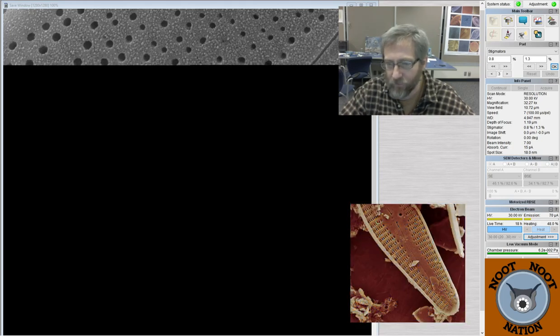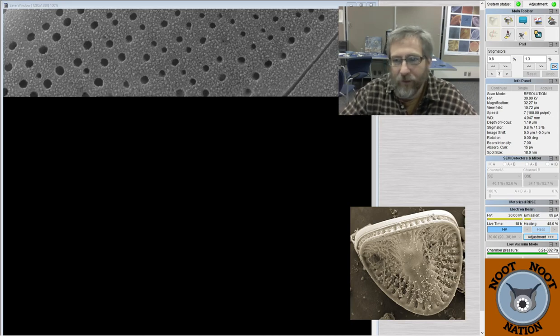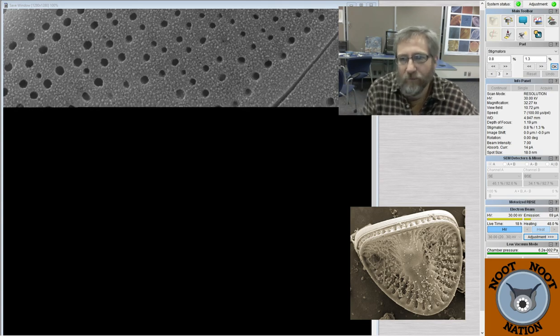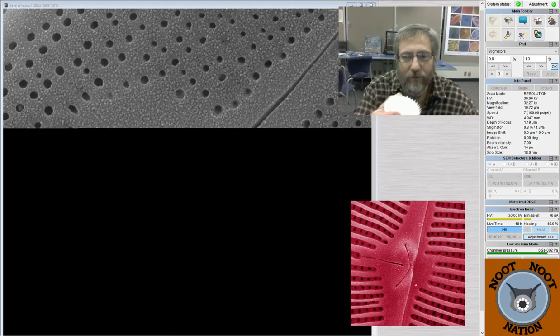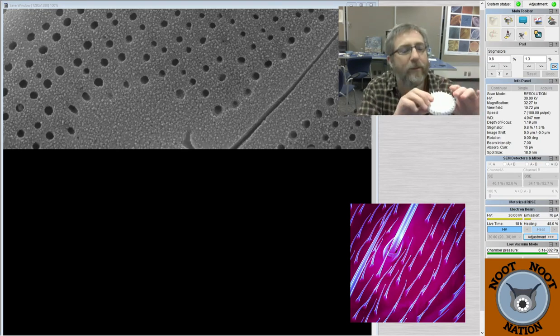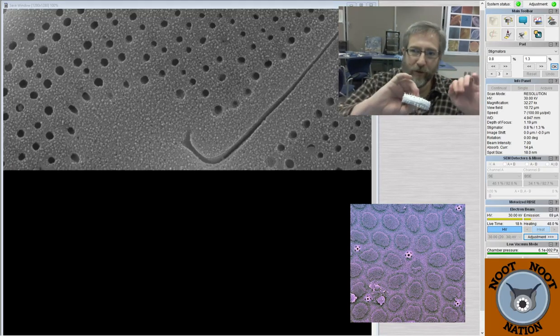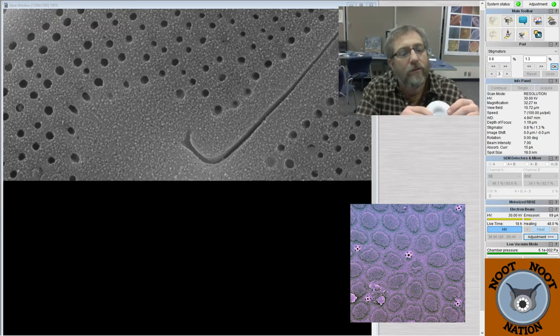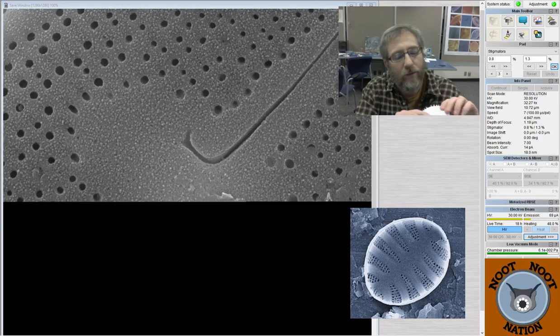I made a note in the title for the stream today that we'll do a little discussion of photogrammetry on the SEM. I've pointed out before that we've made 3D models entirely from SEM images. This one, we cheated and we did half of a diatom and then put it together to make the whole diatom. And I think maybe at some point in the past it might have been glued, but not very well, so that it would sort of sit like a full diatom valve. So I thought I would talk about the process of doing that a little more explicitly and show some of the photographs that we take in order to accomplish this as well.